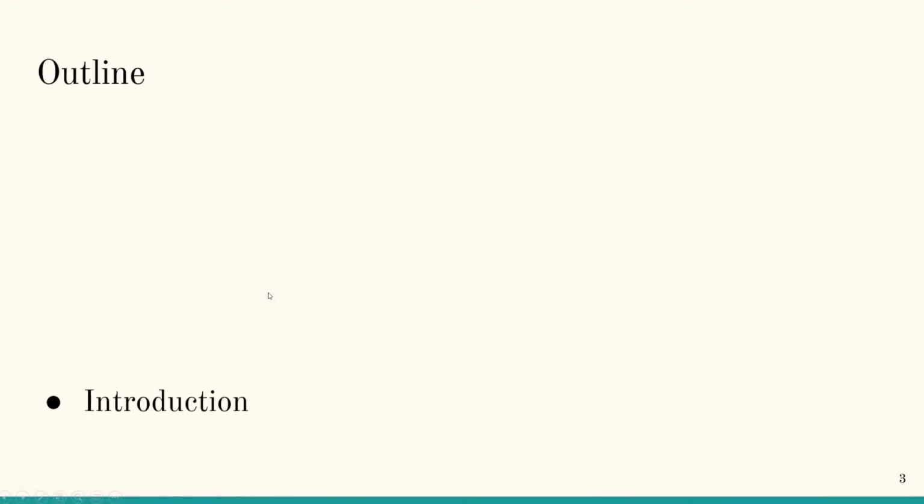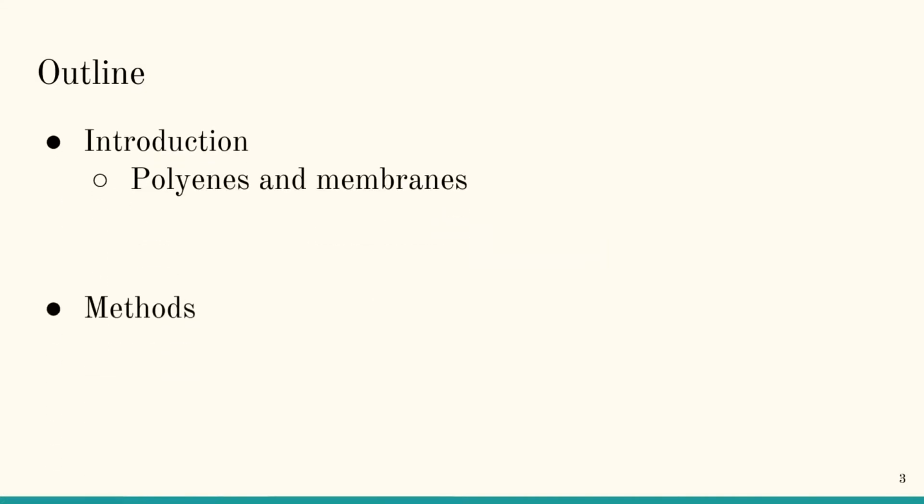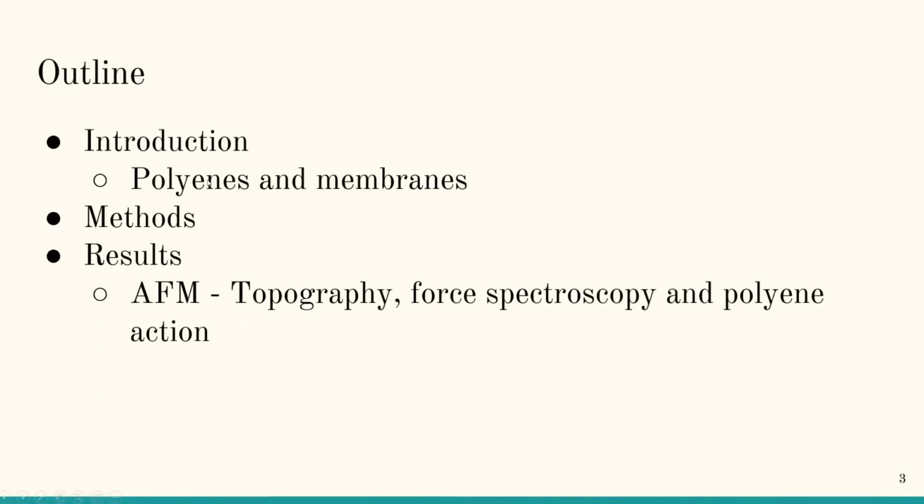The outline of my talk is basically just these points. We're going to give a brief introduction on polyenes and membranes and their interactions. We're going to go into a bit more detail than what Professor Ivan gave in his last talk. I'll also give a bit more detail on the methods, on how we obtain the images, how we analyze the data, and the components of the membranes. I'll show the results of the topographic images, the force spectroscopy, the polyene action, and look at a few conclusions.